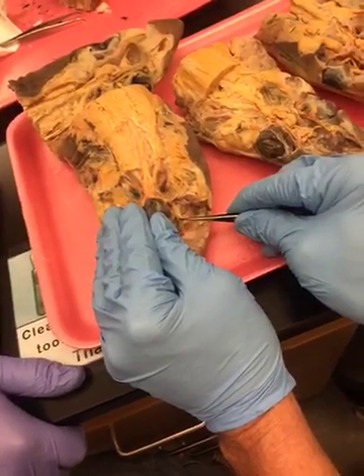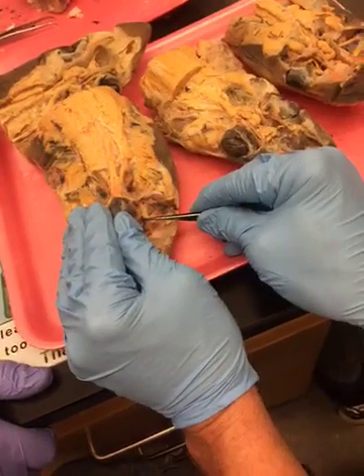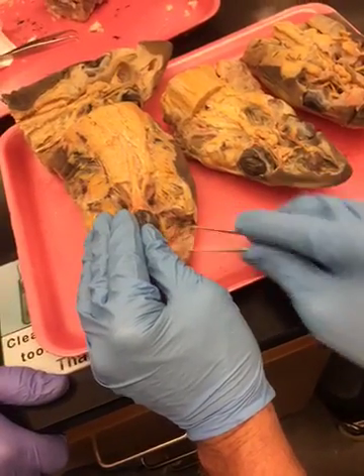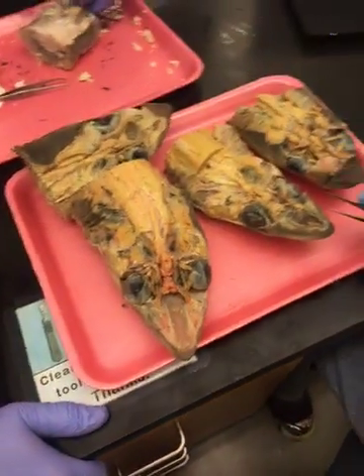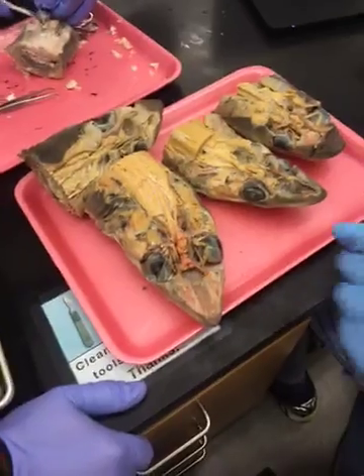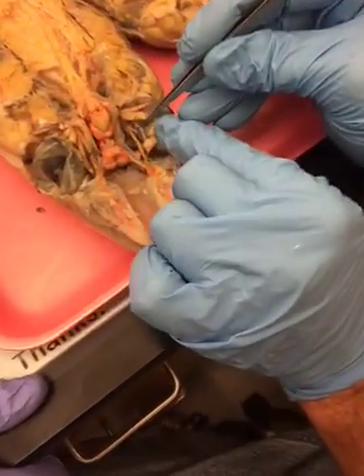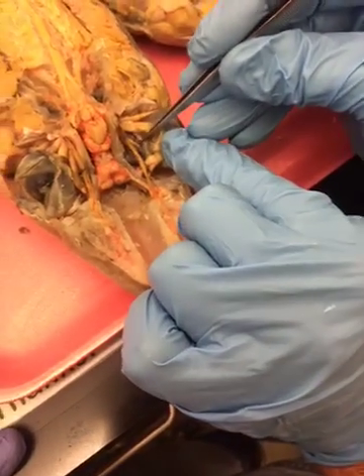Okay? So, you're looking there again at the infraorbital nerve, which is the maxillary branch of 5 and the buccal branch of 7. That leaves only one. Oh, there's still 2 more branches of 5. There's a deep ophthalmic branch which moves along the medial side of the eyeball. There it is right there.